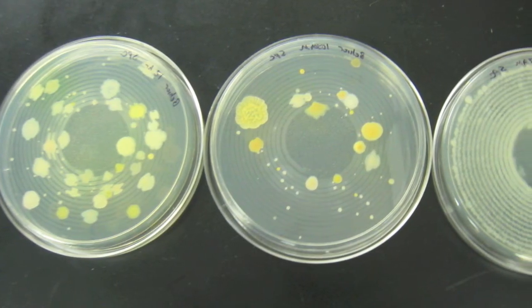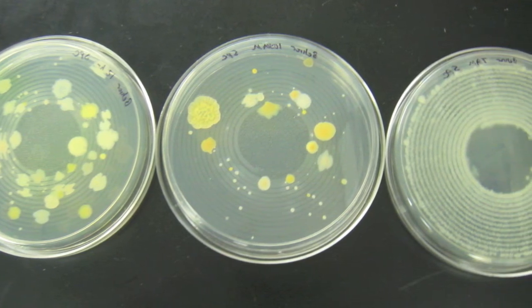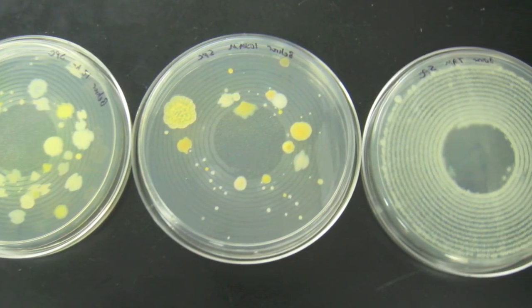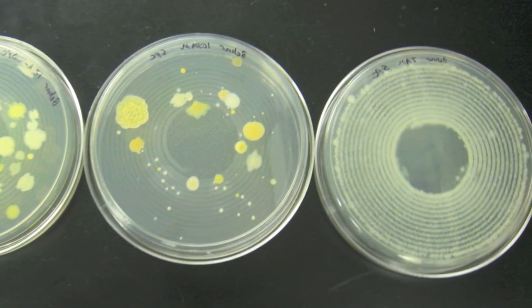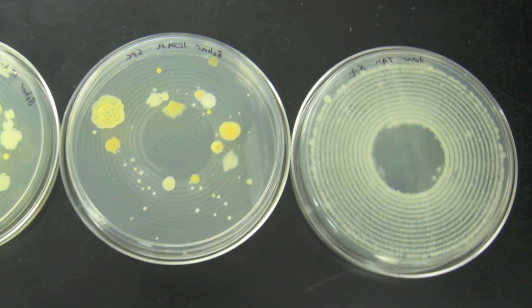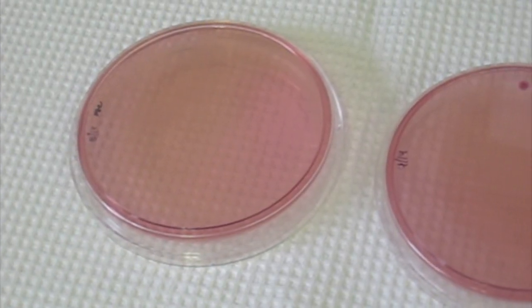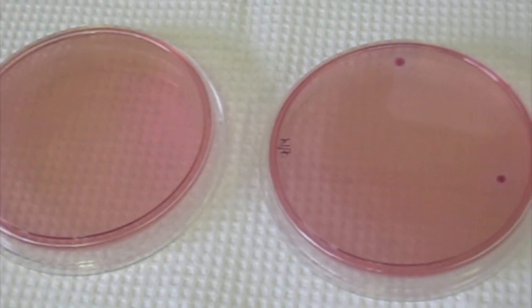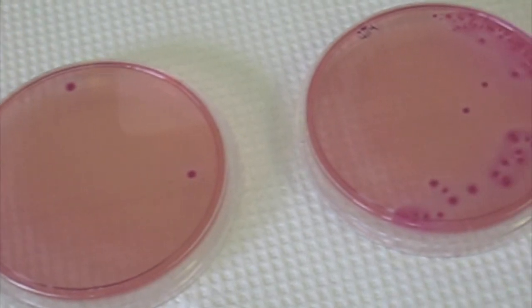You can see what these counts look like on the actual plates. The milk on the left is much cleaner and has a bacteria count of around 1,000 colony-forming units per milliliter. The milk on the far right is much more contaminated with bacteria. This plate has over 10,000 colonies on it. These are MacConkey plates. The plate on the far left is ideal and has no coliforms. You can see a few coliforms on this plate, and way too many on the plate at the far right.